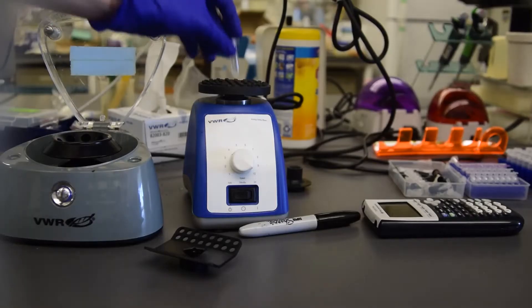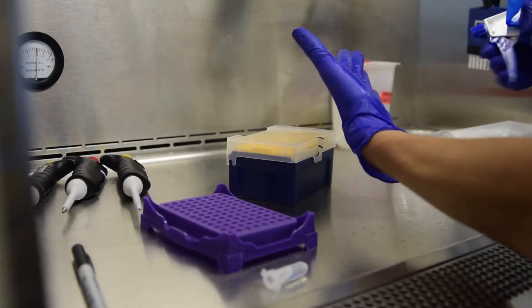You will need gloves for this protocol. Vortex the extraction solution. Clean your gloves and get out PCR strips.